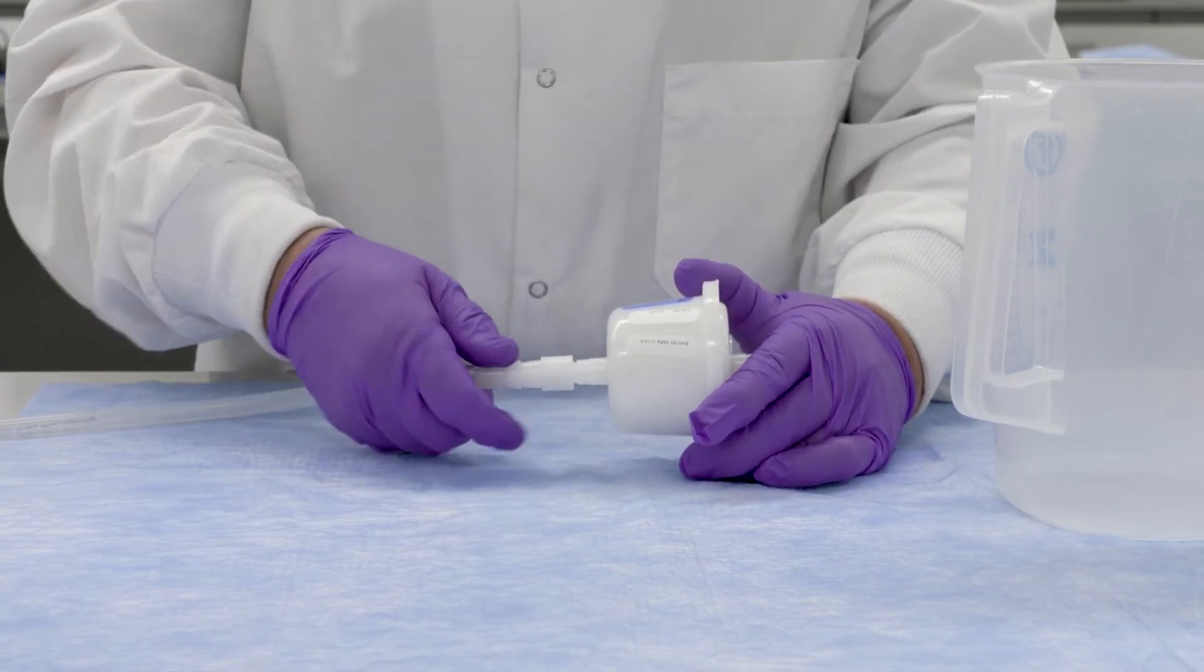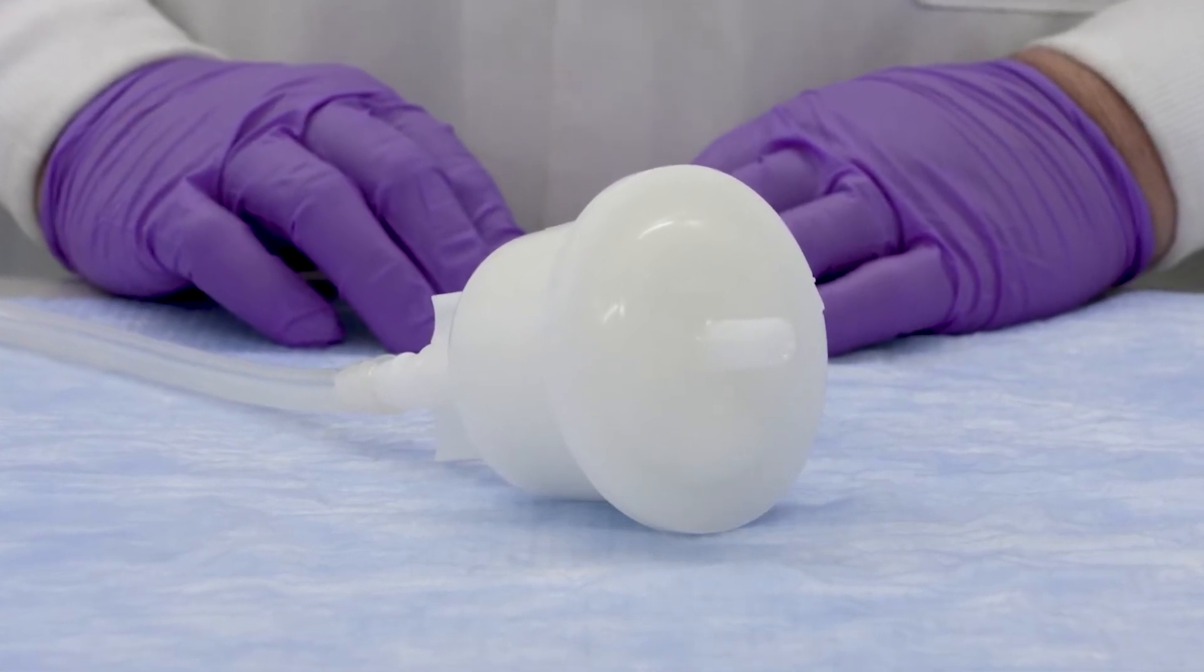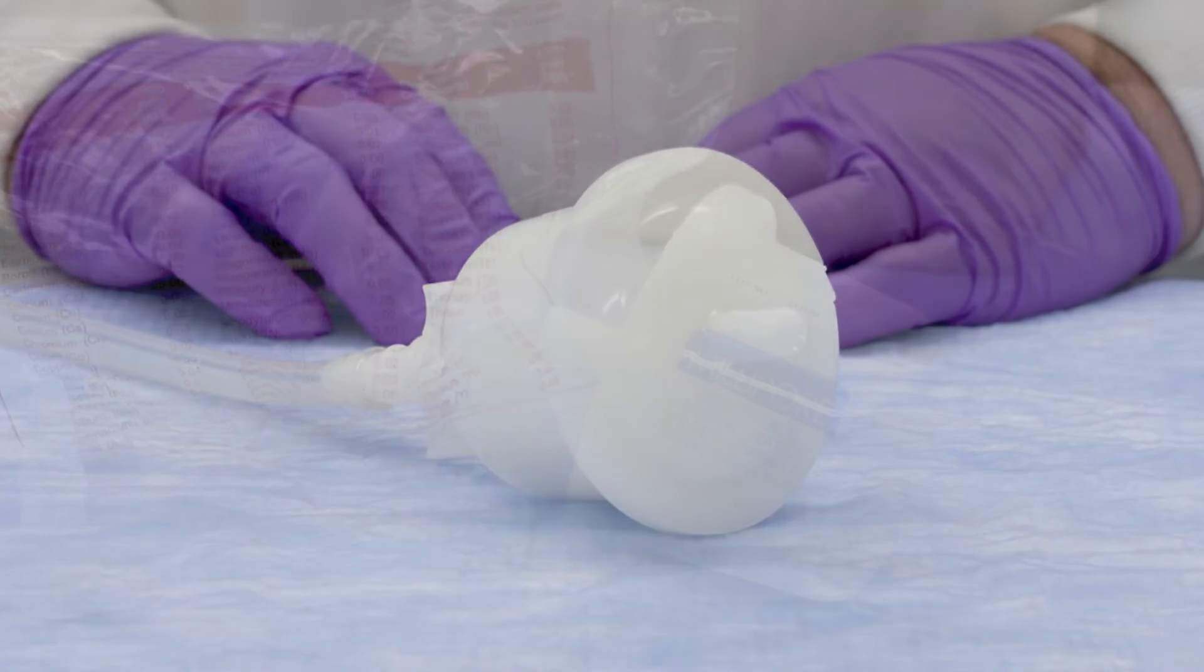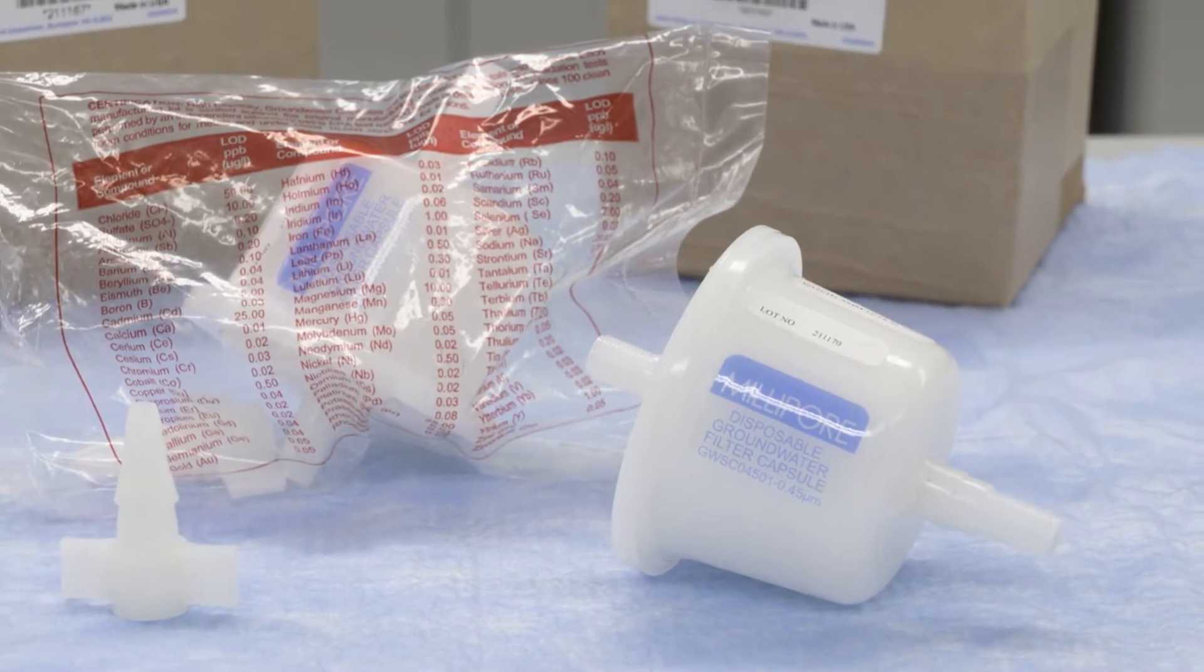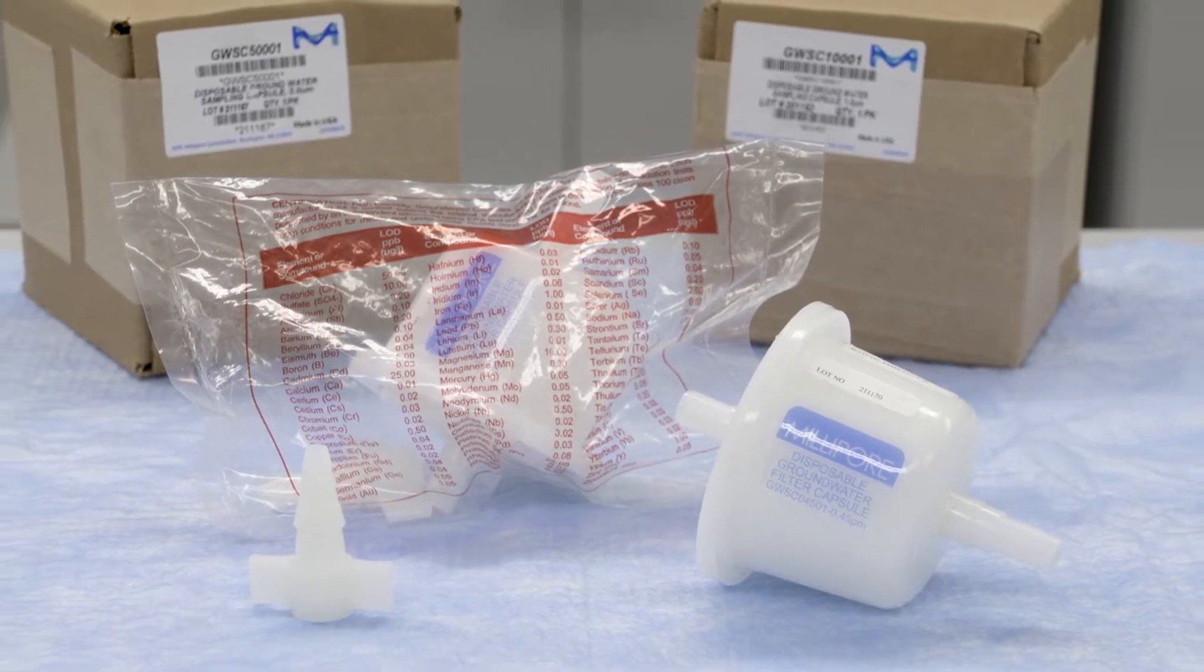The sampling capsules contain a filter or membrane that is sealed into a low extractable high-density polyethylene housing. Three pore sizes of hydrophilic non-woven supported polyethersulfone PES membrane are available.